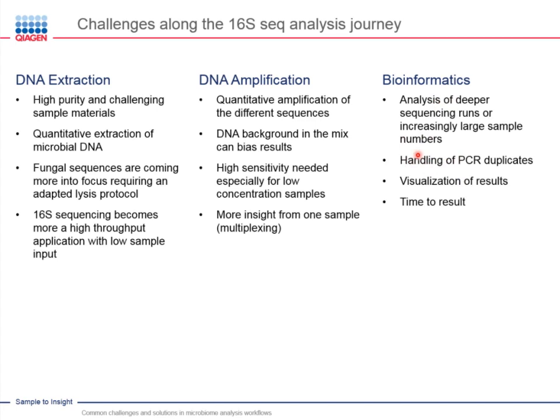And later on, you just don't want to have pure data tables. You want to have them visualized in a good way, ideally usable for a publication or for the next meeting with your lab to present what you're doing. The last point is you don't want to wait 2 weeks for your NGS analysis, so there is the need to have a workflow which has a short time to result and to give the results you need. So those are the challenges before we start into the DNA extraction and amplification.